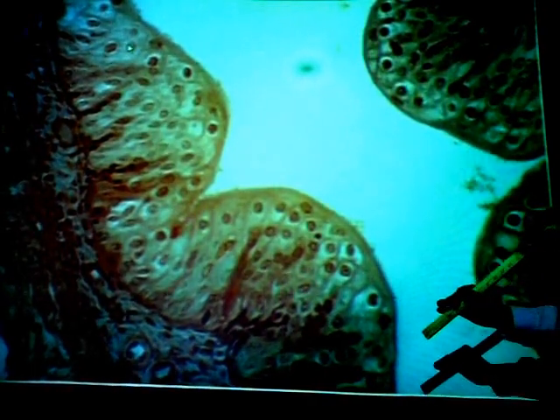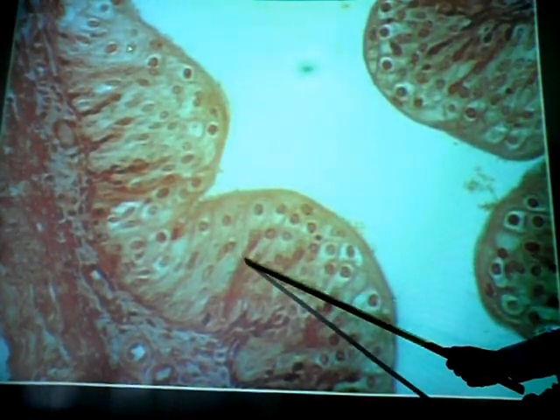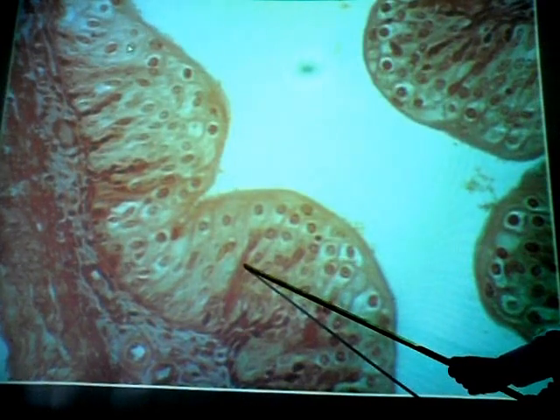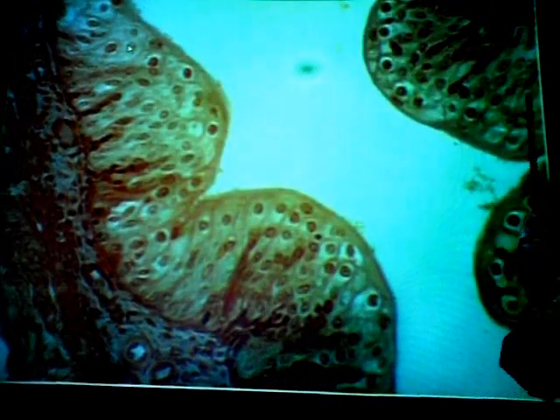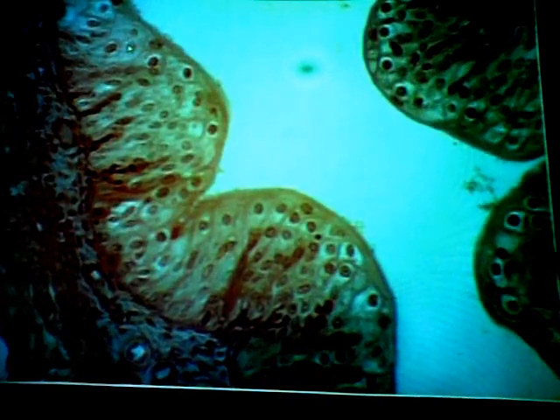As urine passes through, of course, that distends or stretches the wall. Then what would this epithelium look like? Would it look like squamous? Stratified squamous, like a non-keratinized stratified squamous. As urine passes through, it's stretching the wall, so it's going to cause these cells to flatten out.